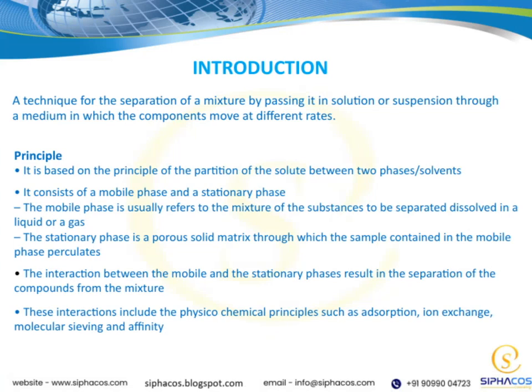Today, I want to talk about the principle behind this separation technique. It's fundamentally based on the idea that the solute distributes itself between two different phases or solvents. We call these the mobile phase and the stationary phase. The mobile phase is typically the mixture of substances we're trying to separate, dissolved in a liquid or gas. On the other hand, the stationary phase is a porous solid matrix through which the sample in the mobile phase percolates. As the mobile phase moves through or over the stationary phase, the interaction between these two phases leads to the separation of different compounds in the mixture.